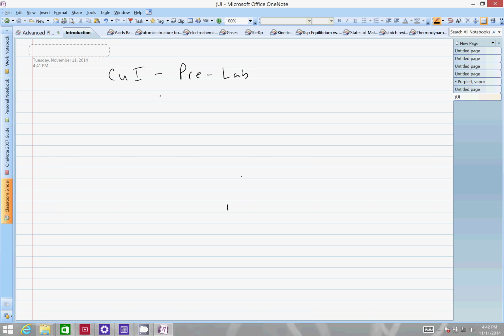The name of this lab is the determination of an empirical formula. A couple of things we'll talk about in this video is, okay, what is an empirical formula? Why will it apply to this particular lab? Some background information. And maybe a tad about the actual procedure.